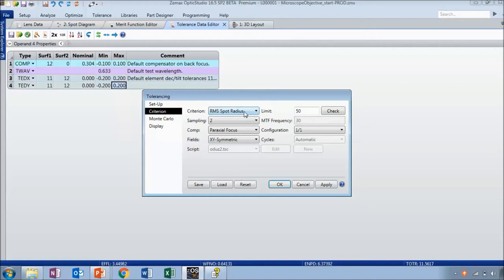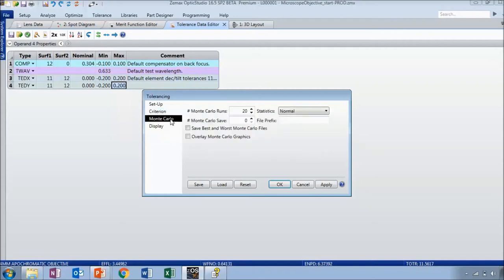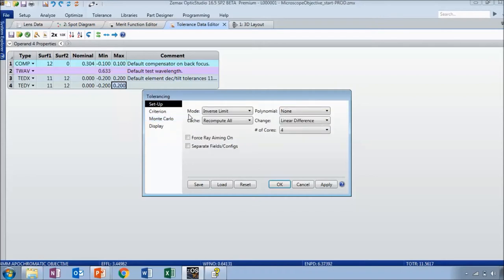In the tolerancing tab, instead of running a sensitivity analysis, we can run an inverse sensitivity analysis. A sensitivity analysis evaluates your system performance at the minimum and maximum tolerances. An inverse limit works the other way — it calculates what the minimum and maximum values should be without surpassing the limit you've set. My criterion is the RMS spot radius. The check button displays what the value currently is, and let's say this value can't go above 0.002 millimeters.